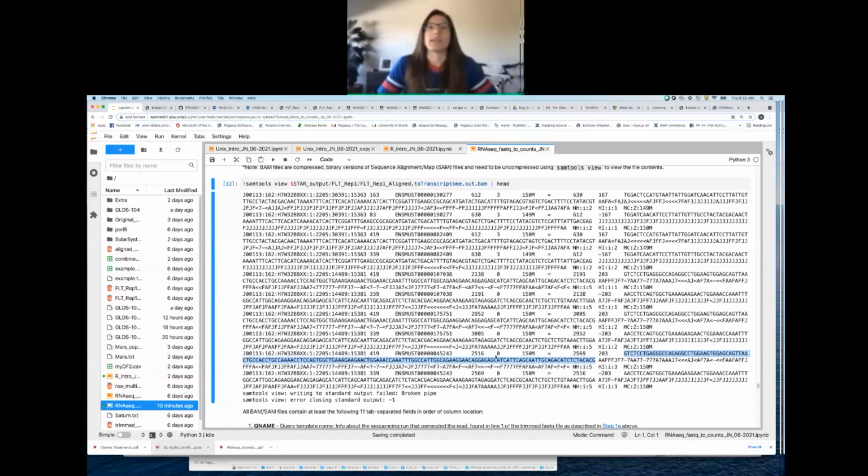If you remember what I talked about this morning, that's determined based on the number of locations that the read pairs align to. If this read pair were to align uniquely, it'll give the max possible mapping quality score, which is 255.